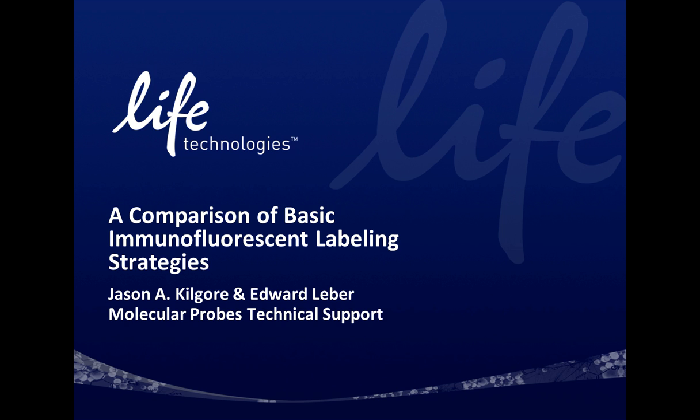Today we're going to have an introductory presentation on the comparison of various basic immunolabeling strategies.